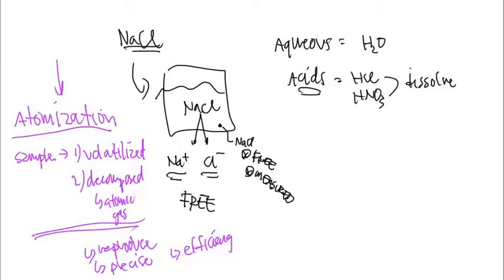If you're part of the competition, then all of these terms are going to be new to you. And what I want you to remember is that no matter what spectrometer you're talking about, for the most part, these pieces and parts are going to be present. So in a way, you're learning now what you will be learning in the future. So in the upcoming video, we'll talk about these pieces and parts, and the light source will be first.